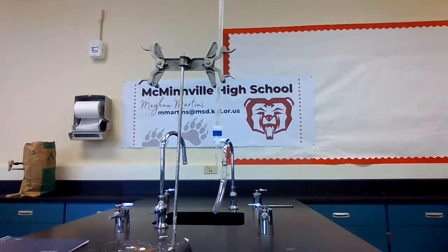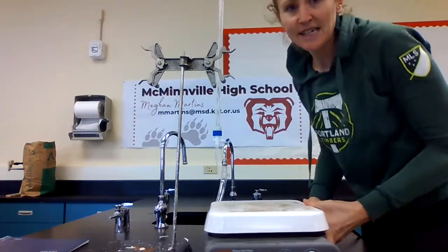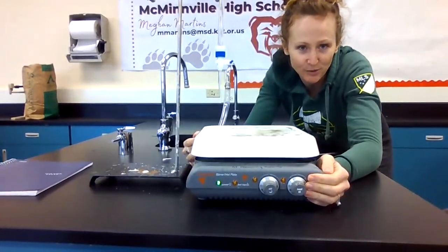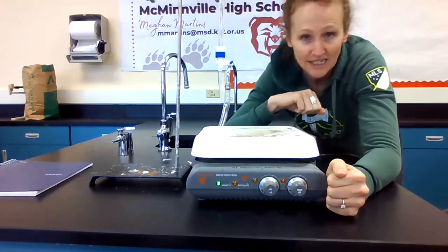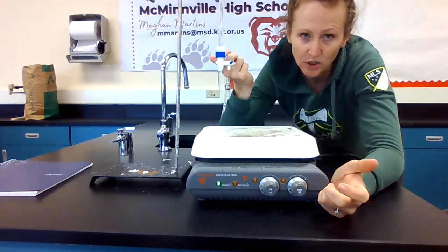Okay, here comes piece of equipment number 4. What is this beast? This beast is our resident hot and stir plate. You'll see the knobs down here. One of these, if you turn it on, actually heats the plate, much like a glass top stove. I'm going to turn the heat off because we don't need that today. But it heats things pretty well and pretty evenly. It's not quite as fast at heating things up as a stove, which can be good in chemistry.